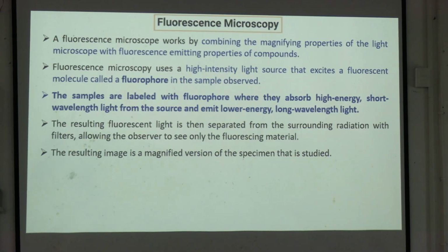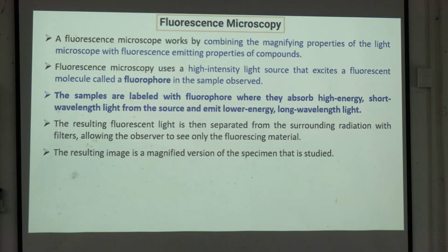Next, fluorescence microscope. Here we will use some short wavelength of light.